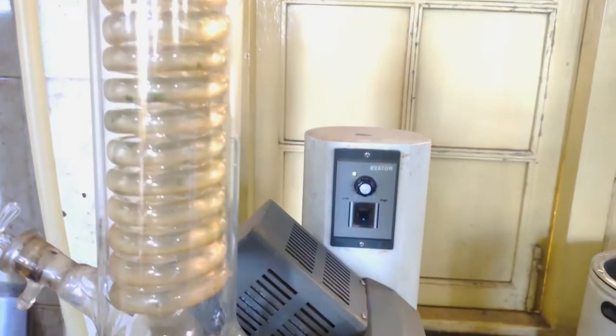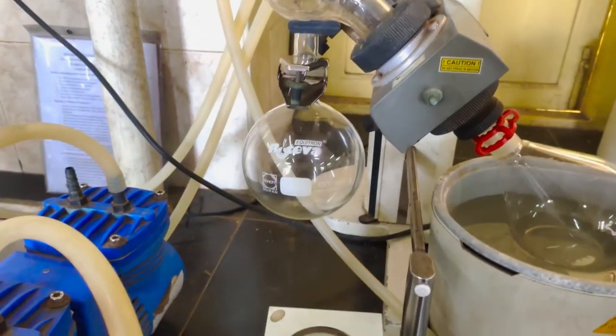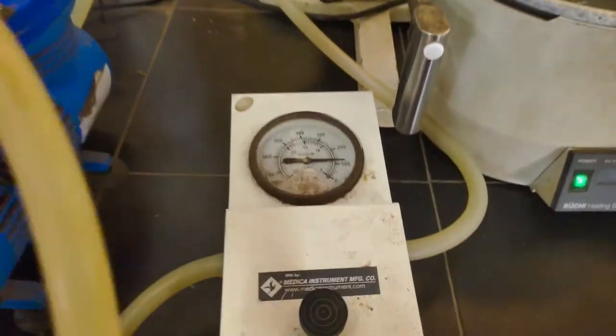The vapors of the solvent reach the spiral column and condense due to the water circulation inside the spiral column, and are collected in the round bottom flask.